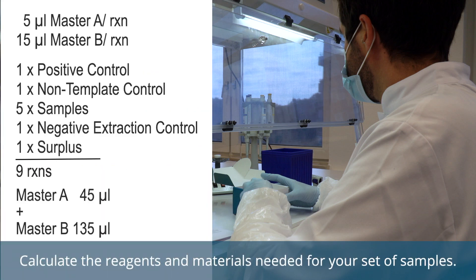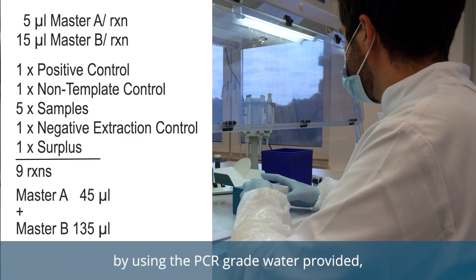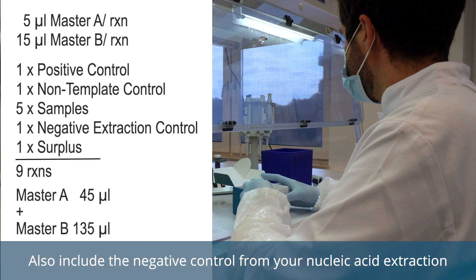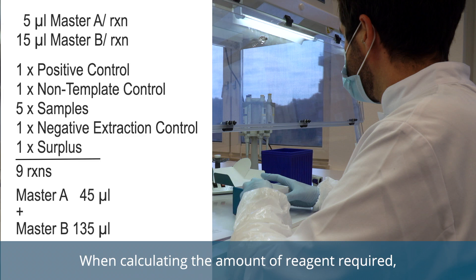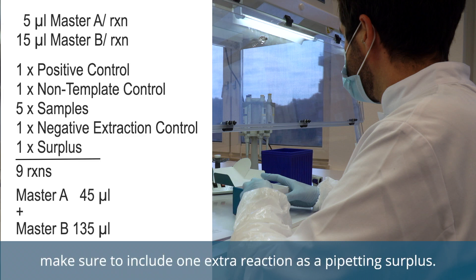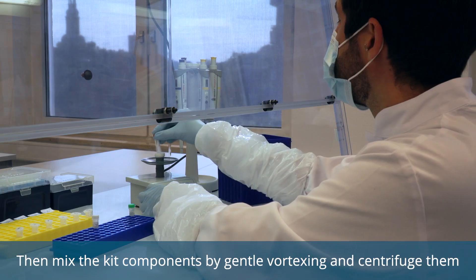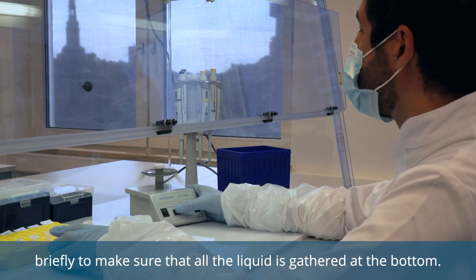Calculate the reagents and materials needed for your set of samples. Please make sure that you include a non-template control by using the PCR-grade water provided, which serves as the negative control in the PCR run. Also include the negative control from your nucleic acid extraction and the positive control or controls from the RealSTAR kit. When calculating the amount of reagent required, make sure to include one extra reaction as a pipetting surplus. Wait until all reagents and samples have been thawed completely. Then mix the kit components by gentle vortexing and centrifuge them briefly to make sure that all the liquid is gathered at the bottom.